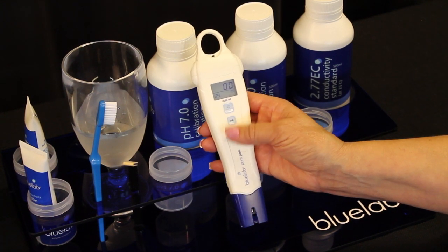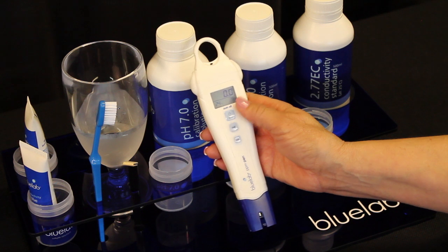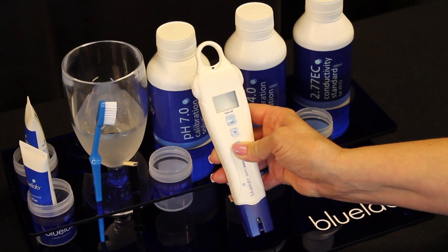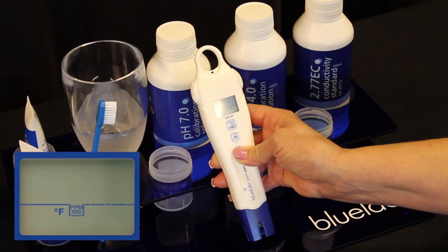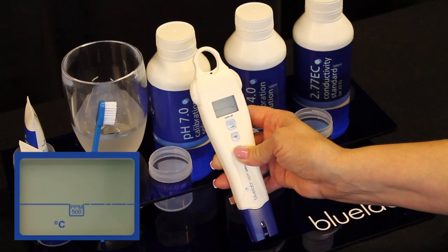Your Bluelab PPM pen has a units button which gives you the ability to change your meter to the settings you prefer. Hold down the units button until the screen starts to flash, then short press the units button to cycle through your settings. You can change it from reading EC to PPM 500 or PPM 700. You can also change it from Celsius to Fahrenheit.